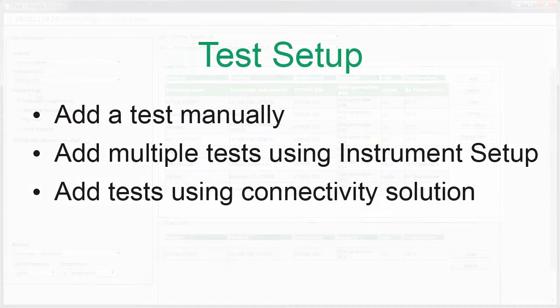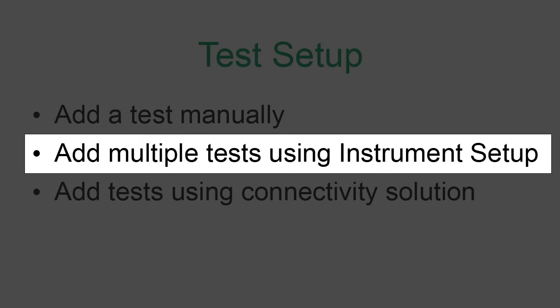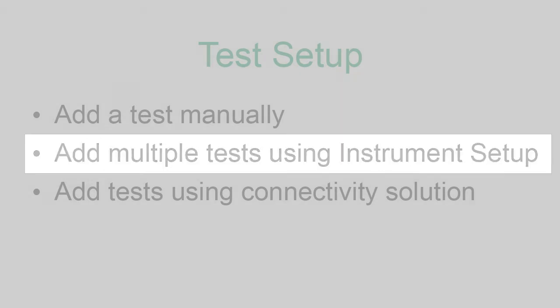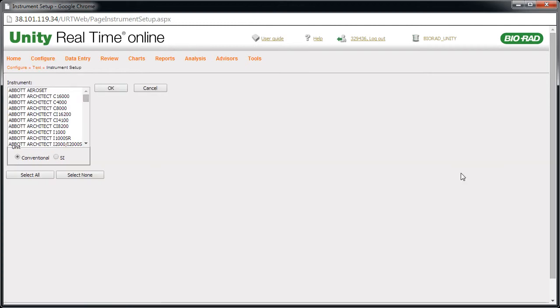In some cases, Instrument Setup is the preferred method because it's faster. It allows you to add multiple tests at the same time. From the Test page, click the Instrument Setup button. The Instrument Setup page appears.